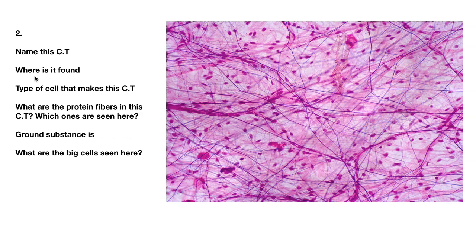What type of cell is making this connective tissue? You see a bunch of cells in here. This is the connective tissue cell. What are these, this connective tissue cell? What are they called that is making this connective tissue?